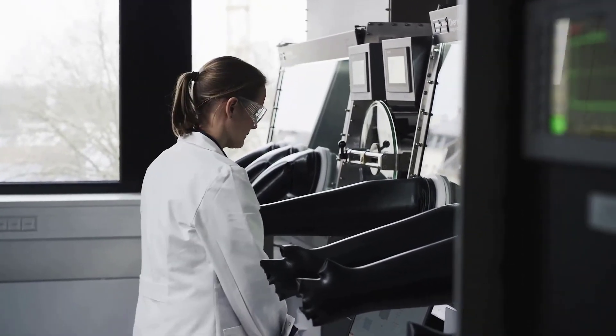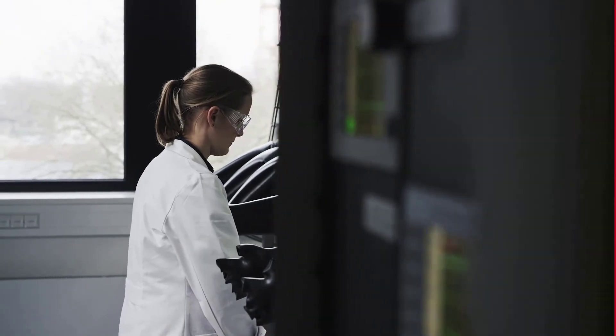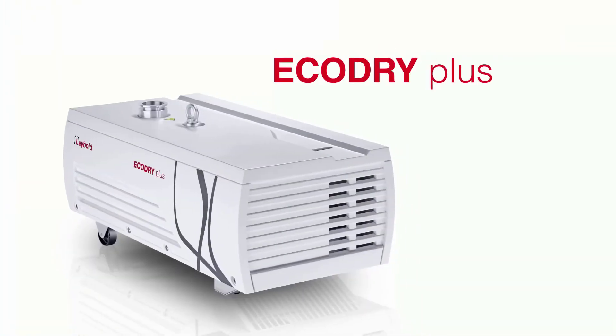Let's turn workplaces into quieter spaces with the new Eco Dry Plus.